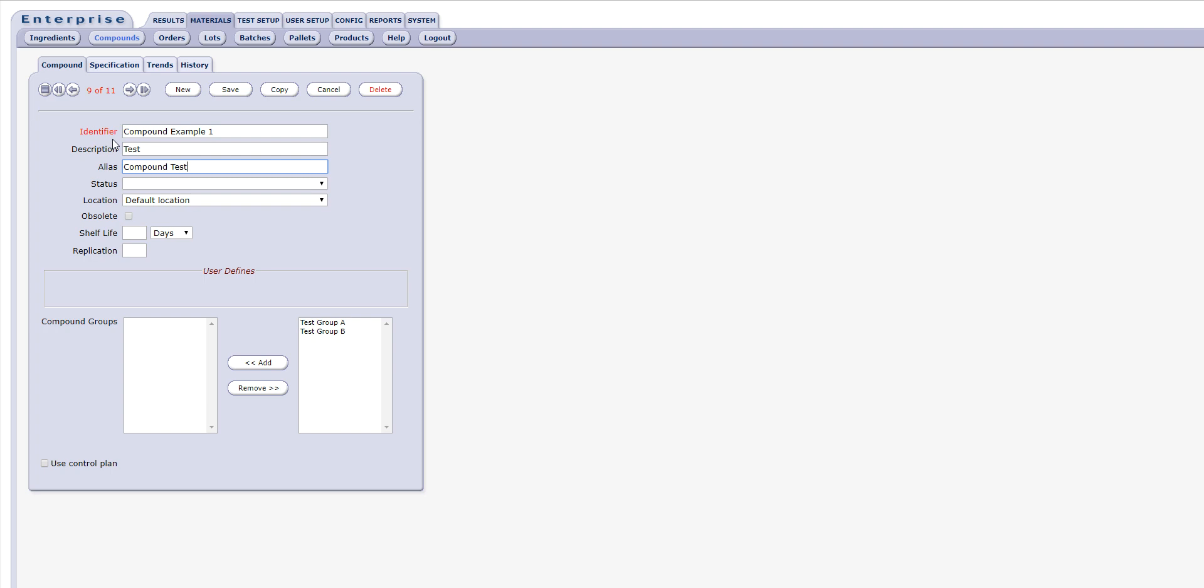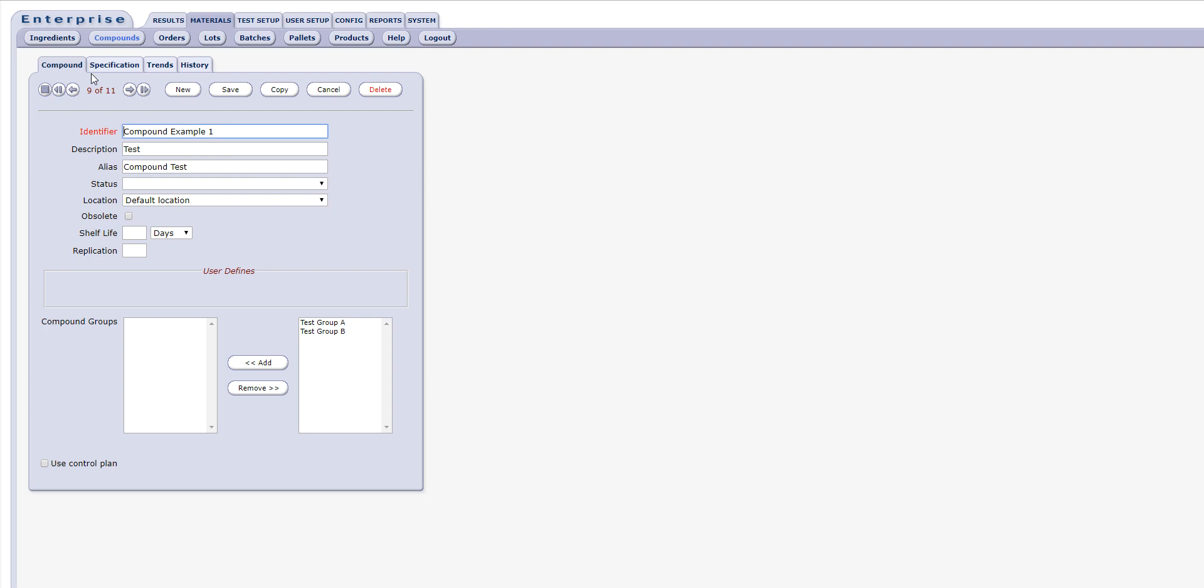Once a name has been entered and the compound is saved, the remaining tabs on the edit form will be activated and available for use.